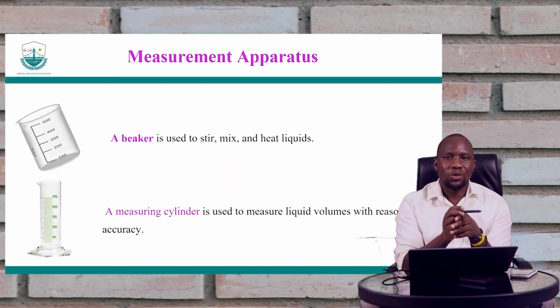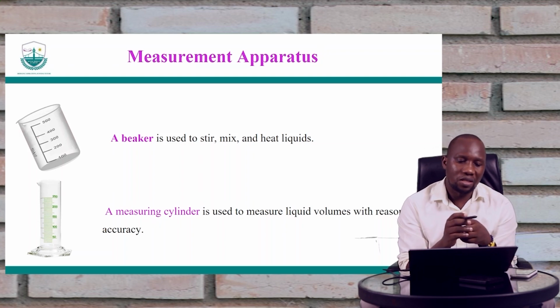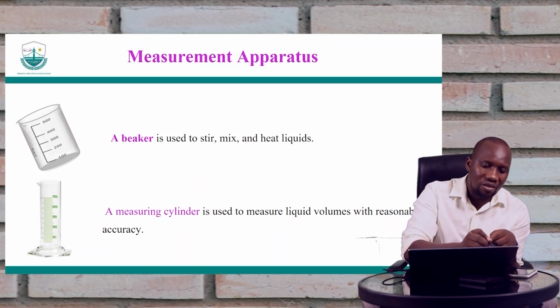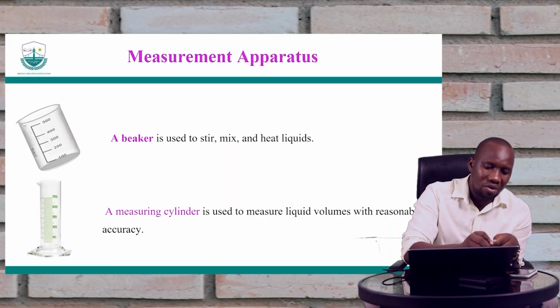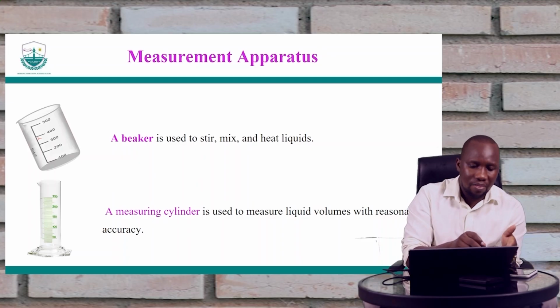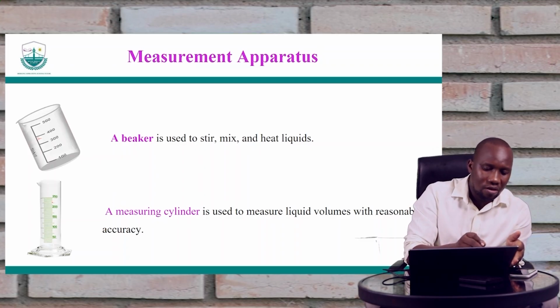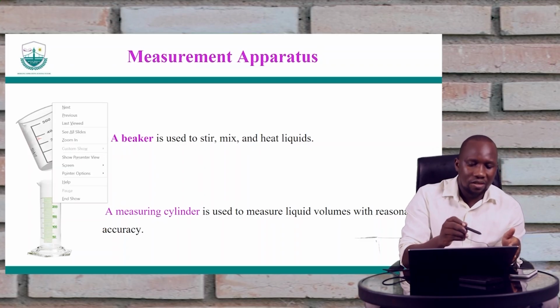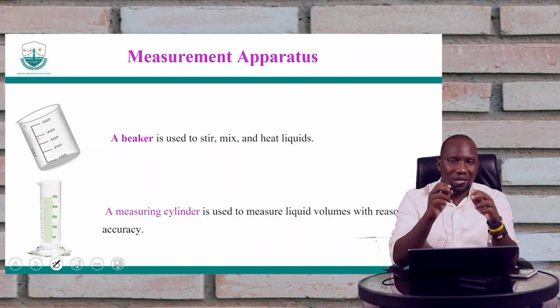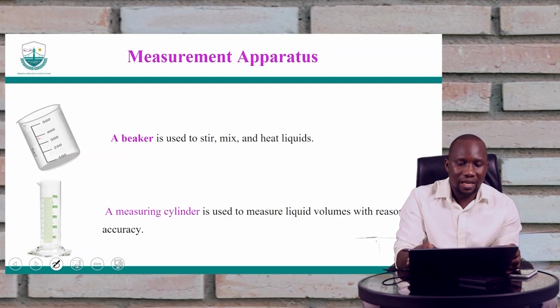If we had marks in between, it would make the beaker more accurate. But since we don't, for you to choose 350, you may approximate it to be here. But here, when you want, for example, 220, you can know that in the middle you should have 225, so 220 is closer there. So that is the measuring cylinder and the beaker.